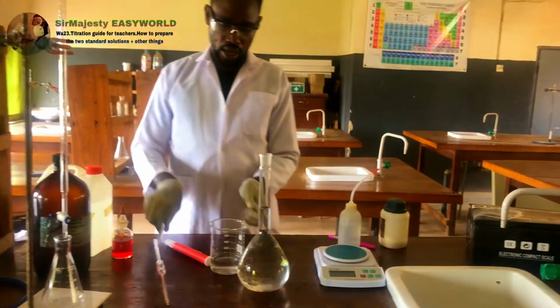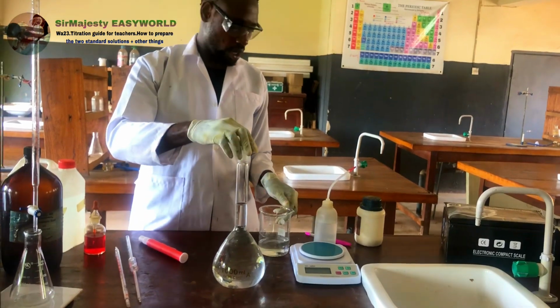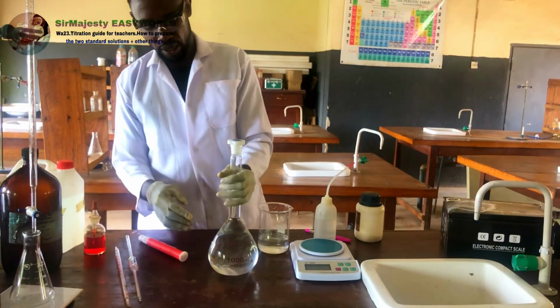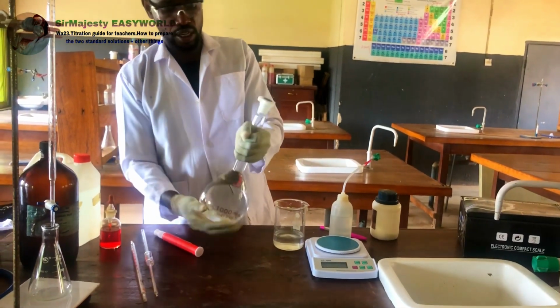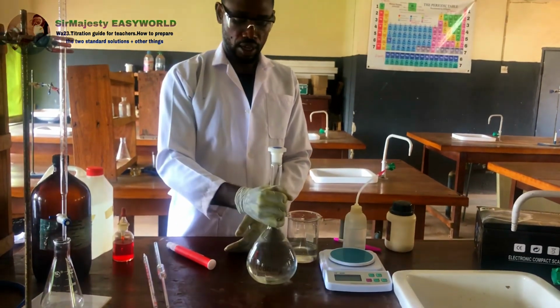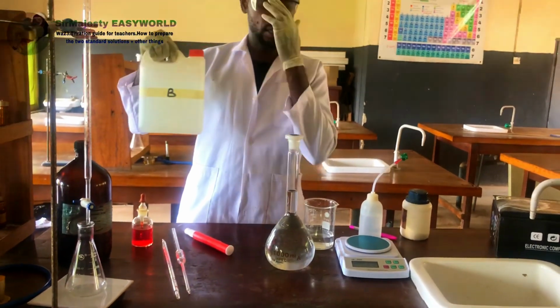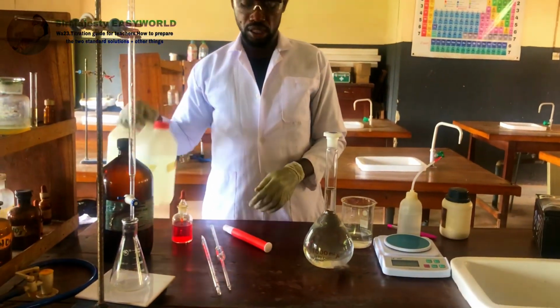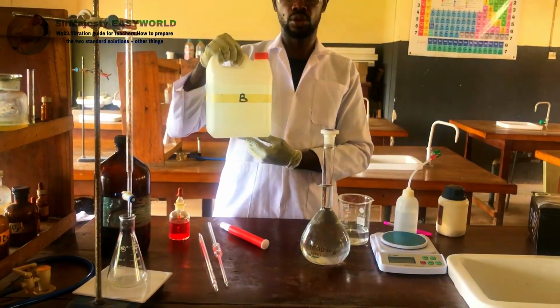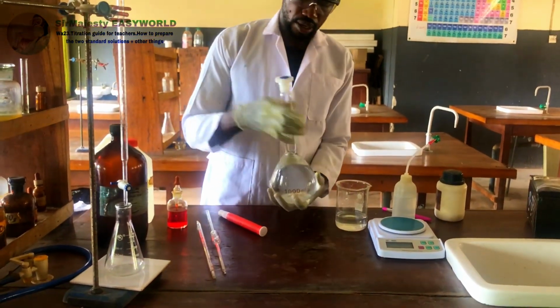You are advised to allow the acid to stand; it mixes well. For this, I prepared it a day earlier. You can prepare this at least a day or 2 days before the exam. Preparing it in the morning will give error, because not all the carbonates have dissolved, so you get an endpoint which is less than normal. But I will run the titration right now.